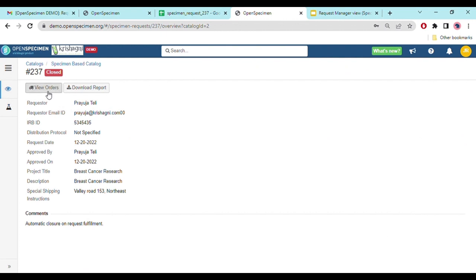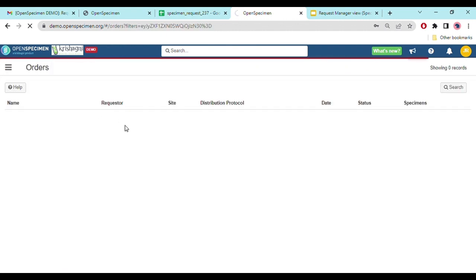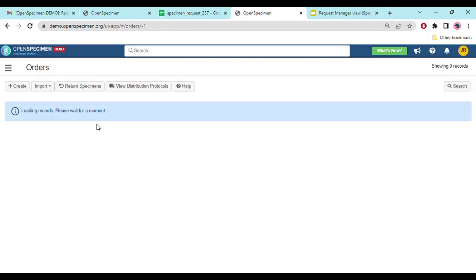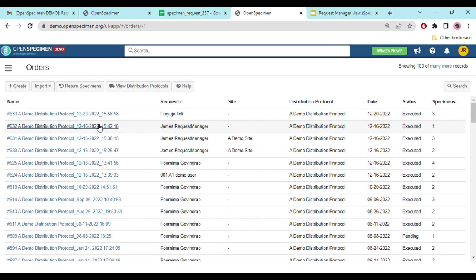You can also view orders by clicking on the order link. On the orders page, you can see which order was created during distribution of the sample, along with the full order details.